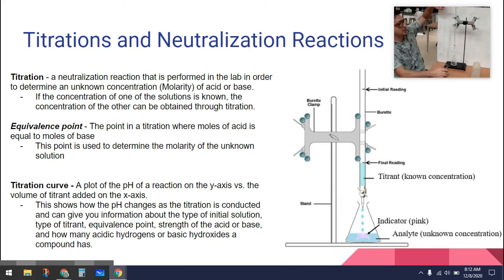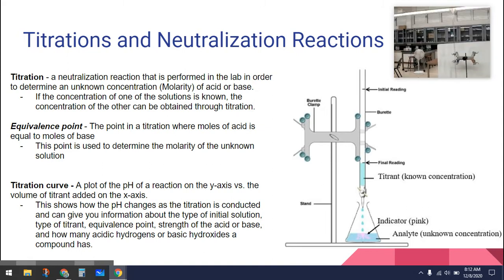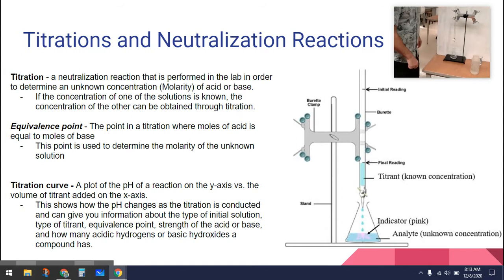I have a 0.1 molar sodium hydroxide solution in this burette. I put a little bit in there already. I take this little funnel on the top and pour the NaOH in, filling up the burette with 0.1 molar NaOH. I know I have 0.1 molar NaOH in here. If I know how much base I add and I know its molarity, I know the number of moles of base — and since moles of base must equal moles of acid at neutralization, I can find the acid's concentration.